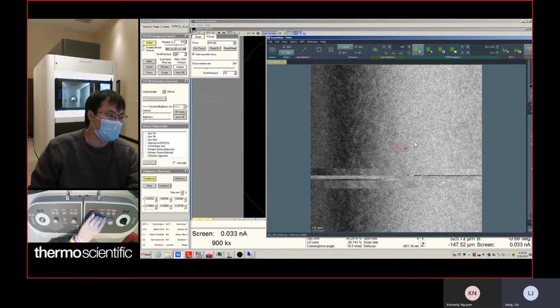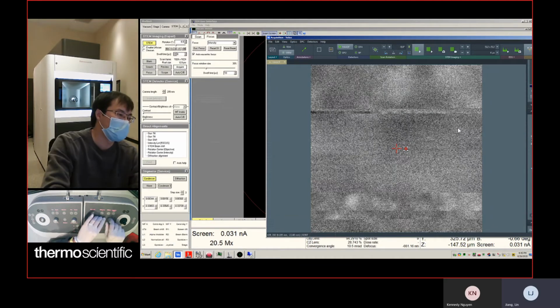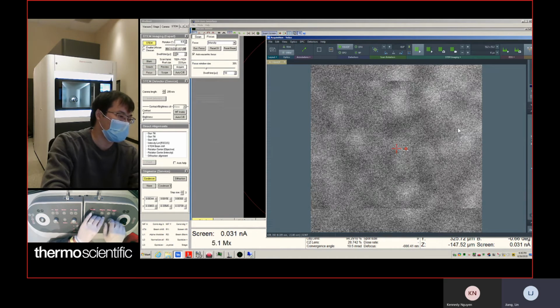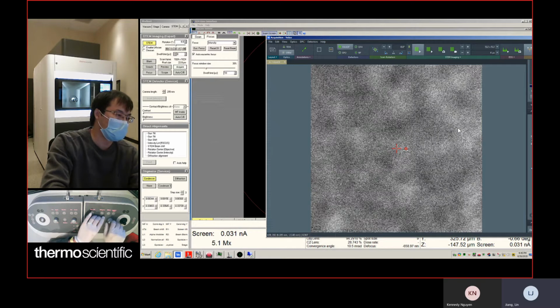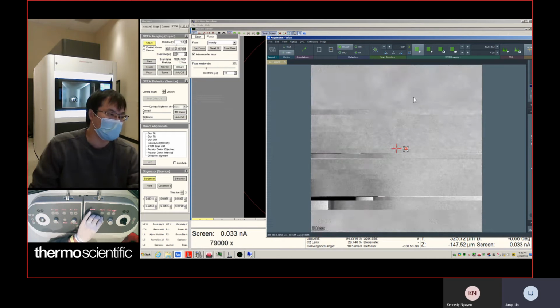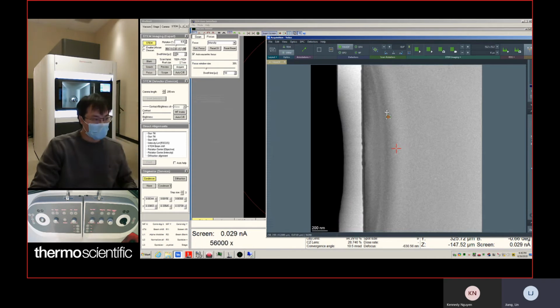If you have a sample that's not flat, it's going to take time to tilt to the axis. But you can start from a region, like for this sample, for example, let me draw it out. So you see this sample has curtaining here.